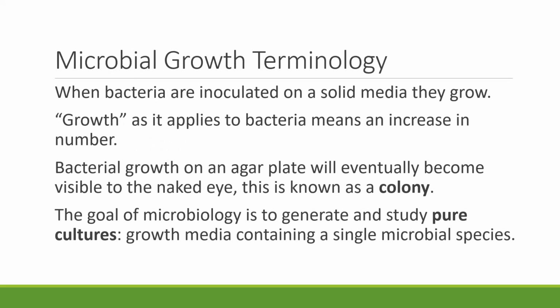So when we talk about bacteria and we want them to grow, we're going to take them and place them onto a solid medium and get them to grow. But growth does not mean that each microbe cell is going to get larger. No. In microbiology, the term growth of bacteria means that they get larger in number, so that the amount of cells increases.